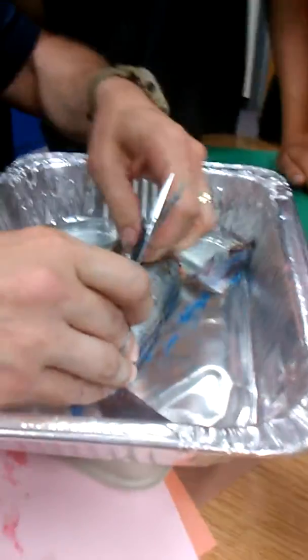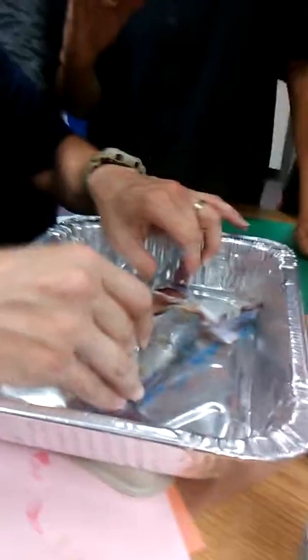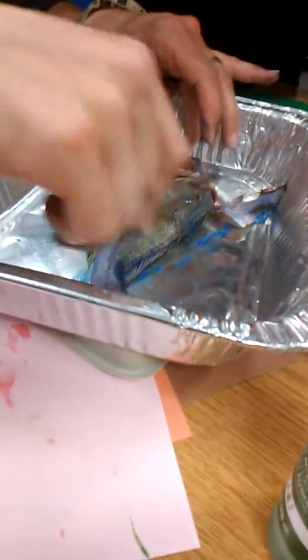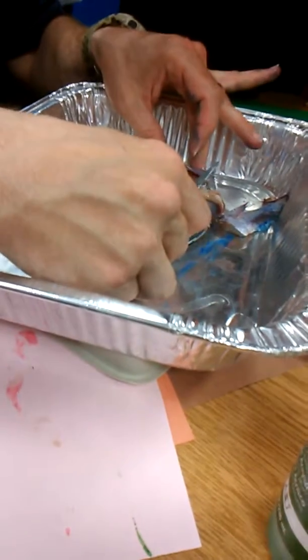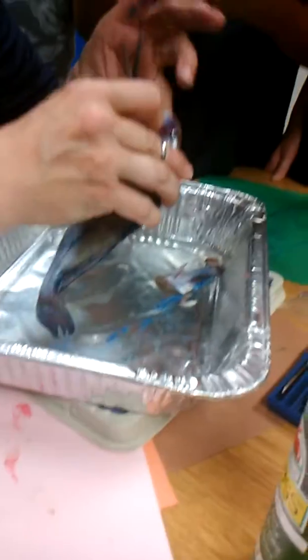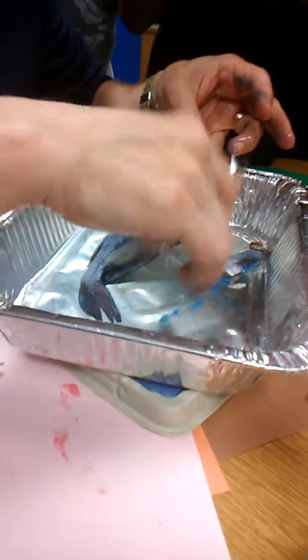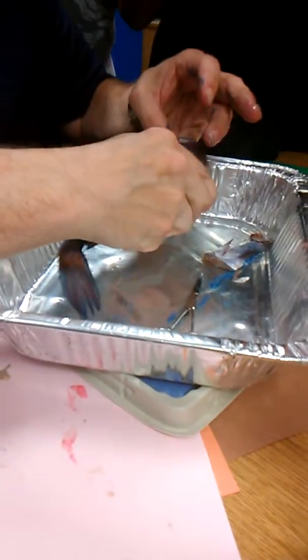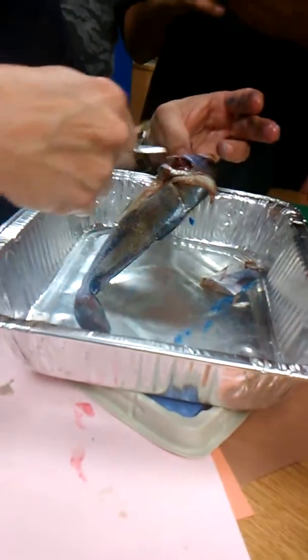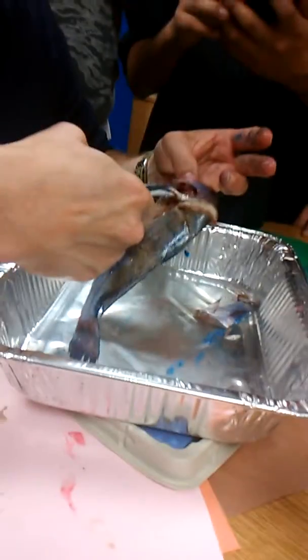They've also got this tube that goes straight from their mouth all the way to their anus — that's the hole where the poop comes out. It's all connected, so when they eat food it comes in their mouth. A drum like this actually has teeth way back here in the back of the mouth.